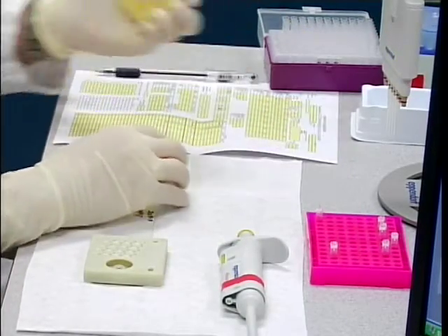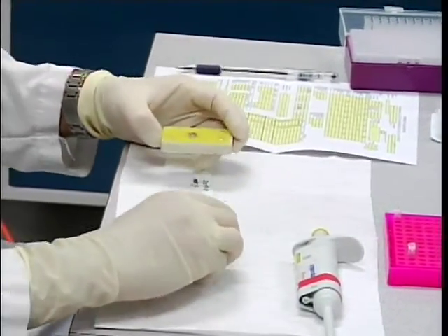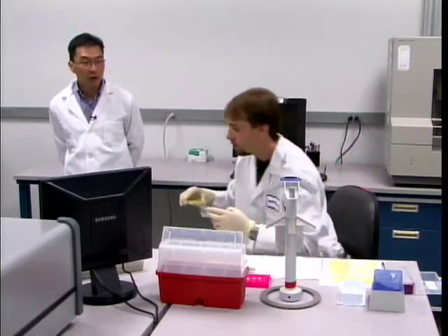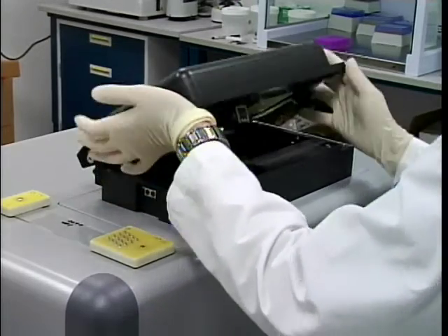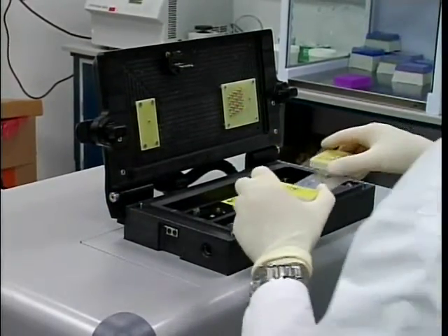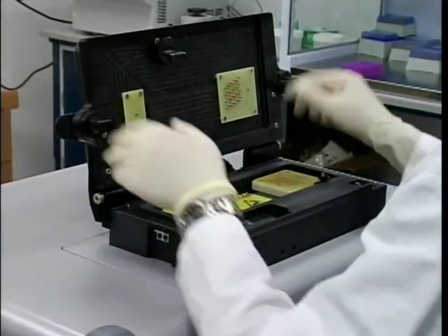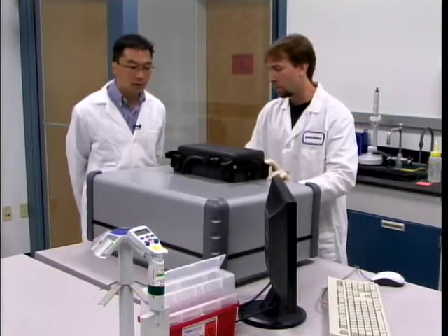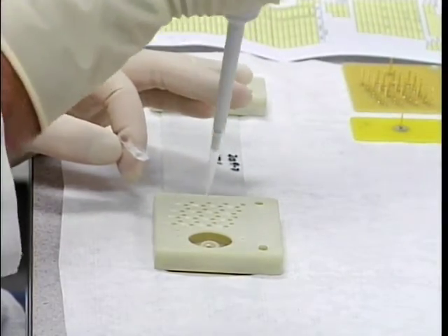After loading the samples, electrode boards are placed on the anode side and the cathode side of the biochip, and the biochip is ready to be loaded into the instrument. Once loaded, you can see the chip chamber where the biochip will be inserted. Every single run requires a separate biochip, so while one is running, another can be prepared with samples and made ready for the next run.